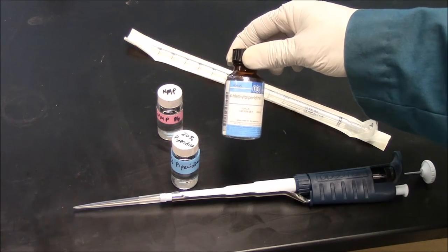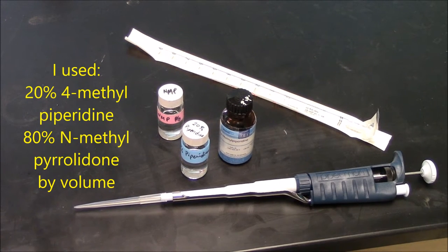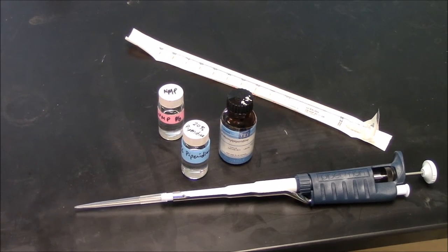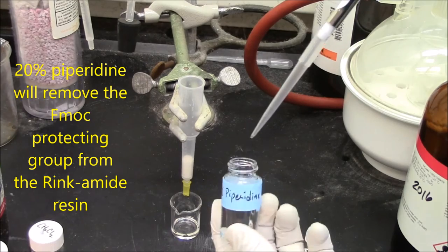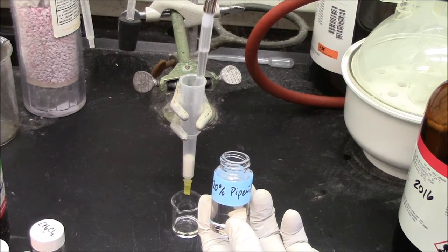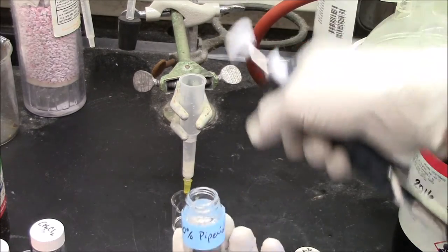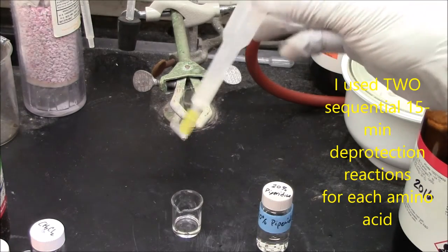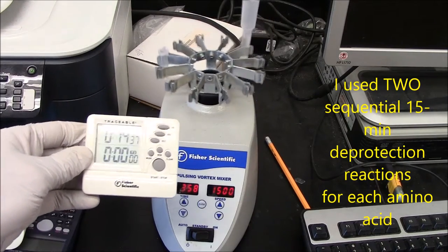The rink-amide resin starts with an F-moc group attached. To remove that, we'll make a solution of piperidine in NMP, 20% piperidine, 80% NMP. Piperidine is a base that will selectively react with the F-moc group. I'm adding a milliliter of 20% piperidine to the beads in the column. I'll use the lid, snap, and I'll agitate by hand first. Here I have it on the vortexer, 1500 RPMs, 15 minutes.